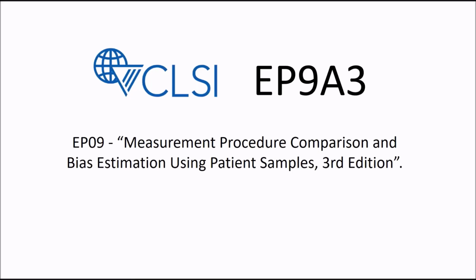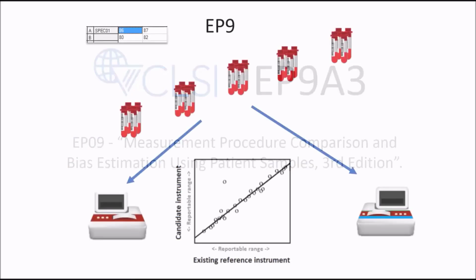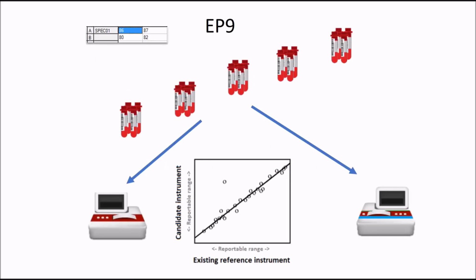The module can be used to test new lab instruments against existing trusted instruments, or to evaluate the performance of new instrument designs as part of the manufacturer's evaluation and validation processes.